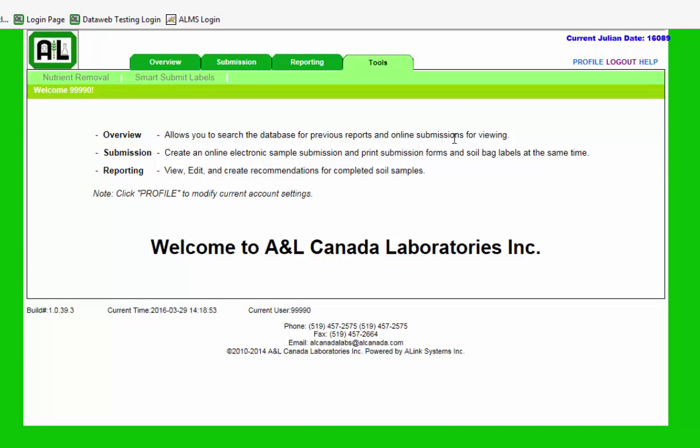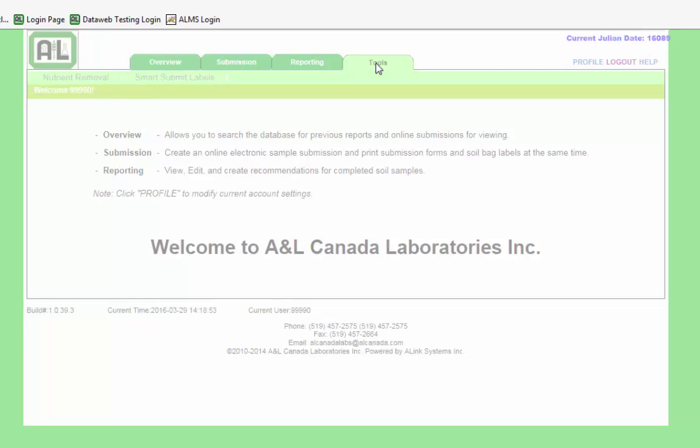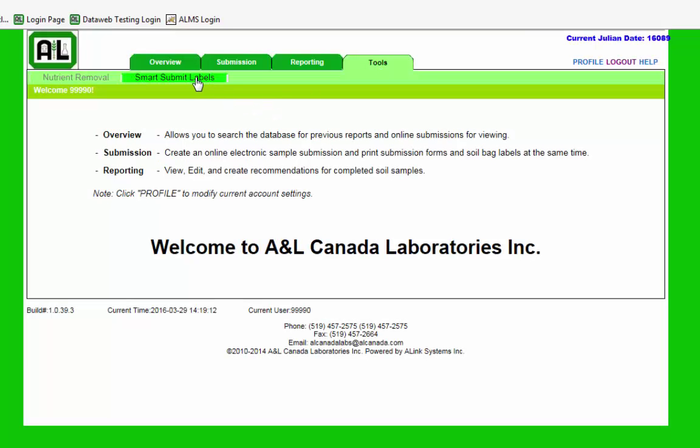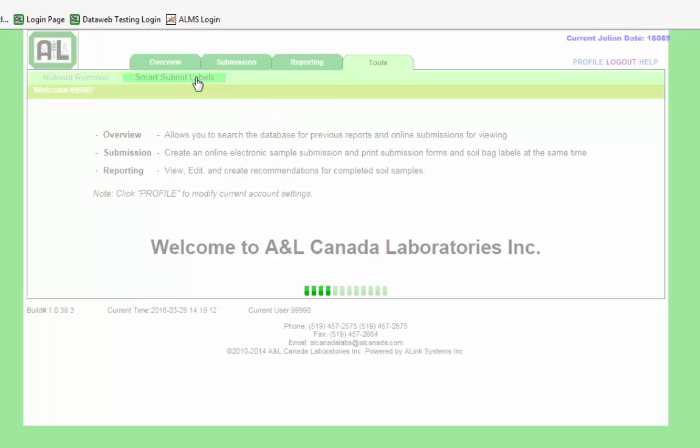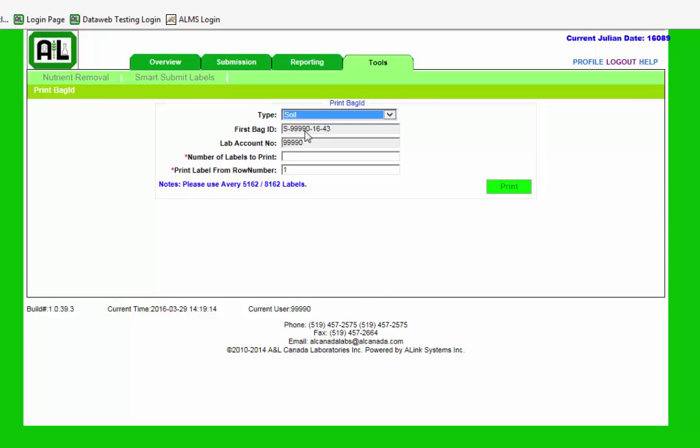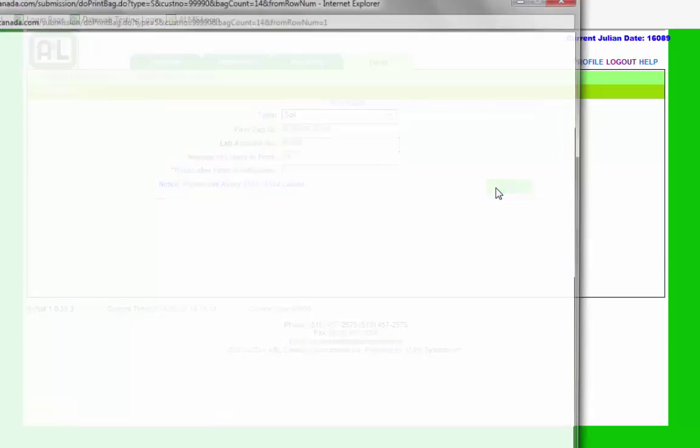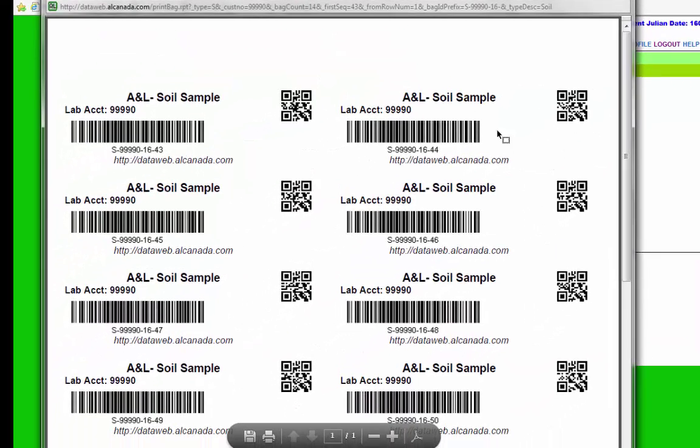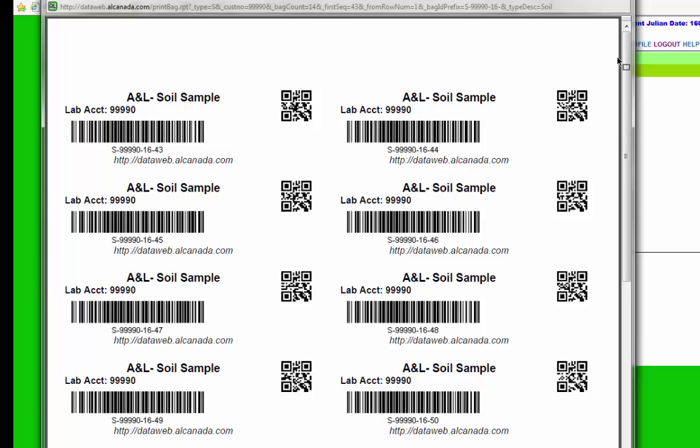Once you're logged into the DataWeb, you'll go under the Tools menu, Smart Submit labels. From here you have the option to print out the different module submission labels. Take note it uses Avery 5162 labels you can get at Staples or other office supply stores. You can print off as many sheets as you want and then just stick those labels right on the bag.